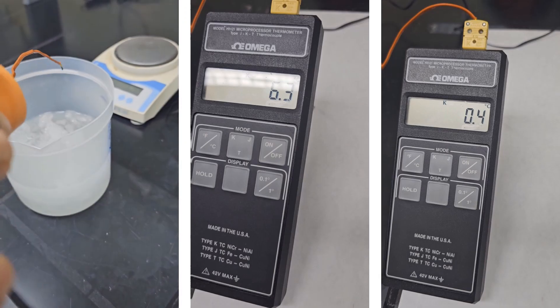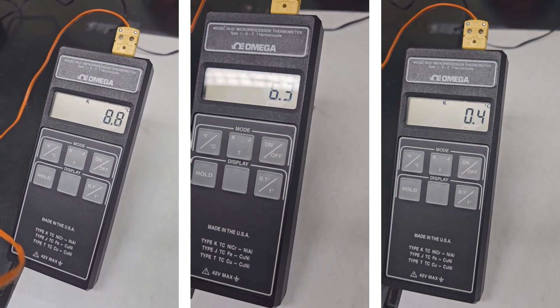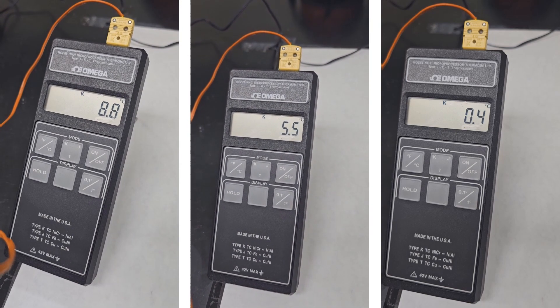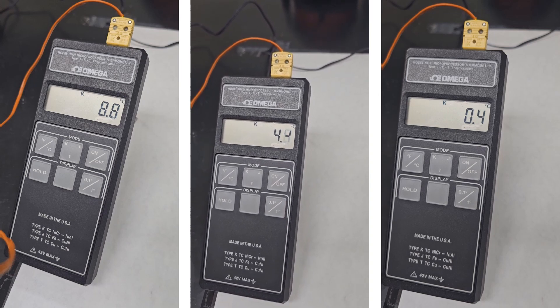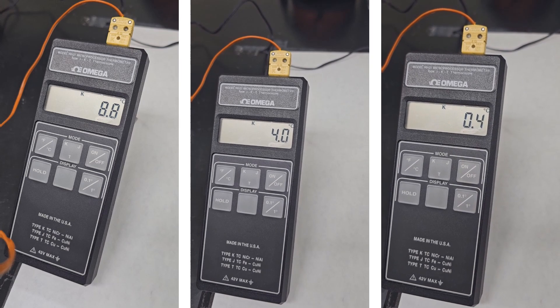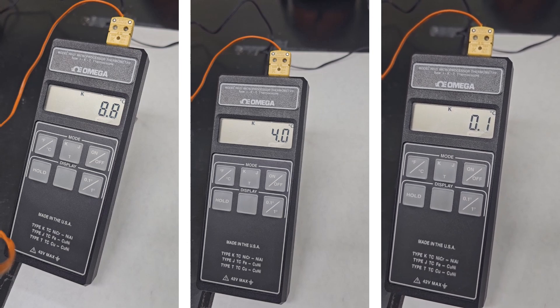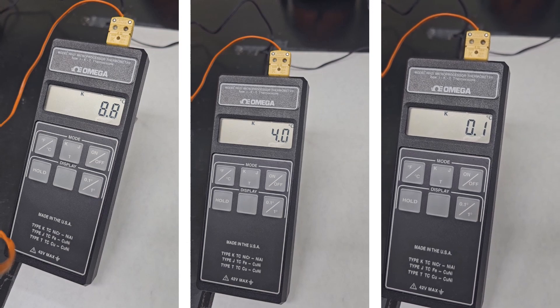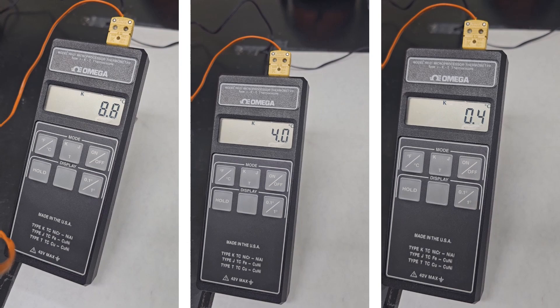First, the digital thermometer needs to be calibrated. In this case, we are using an ice-water mixture to calibrate. The thermometer should provide a reading at 0.0 degrees C; however, it displayed 0.1 degrees C. Therefore, the measured reading should be subtracted by 0.1 degrees C.